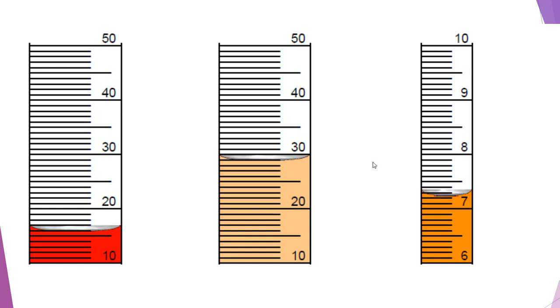We are using decimal places, tenth places for our hash marks now. So this first line is 0.1. The next line is 0.2. Next is 0.3, then 0.4, 0.5, 0.6, 0.7, 0.8, 0.9, before you get to 8 milliliters.